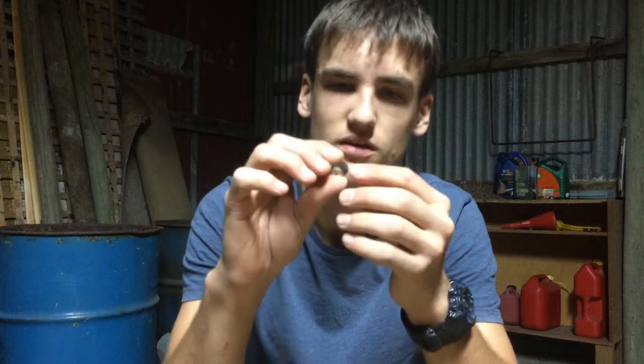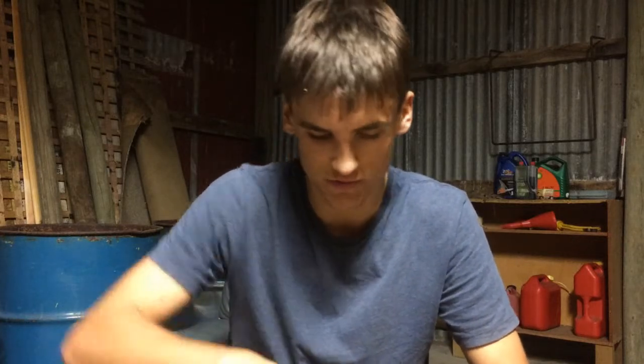I've also got a couple of lenses here. You can see these are just little glass — actually I think they're plastic lenses from a microscope and from a telescope. I got different lenses from a microscope and a telescope that I took apart. It's funny because I'm using lenses from a microscope to make a microscope, but these ones actually I think were from the telescope.